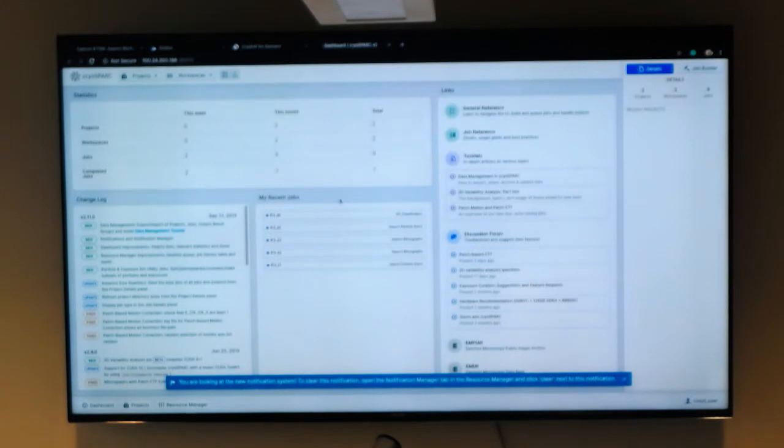The tutorials that are online have a lot more information than I'm going over, but I'm just going to go over the basics to give you your bearings. Again, I want to give you license in an environment to just try to make use of these programs.